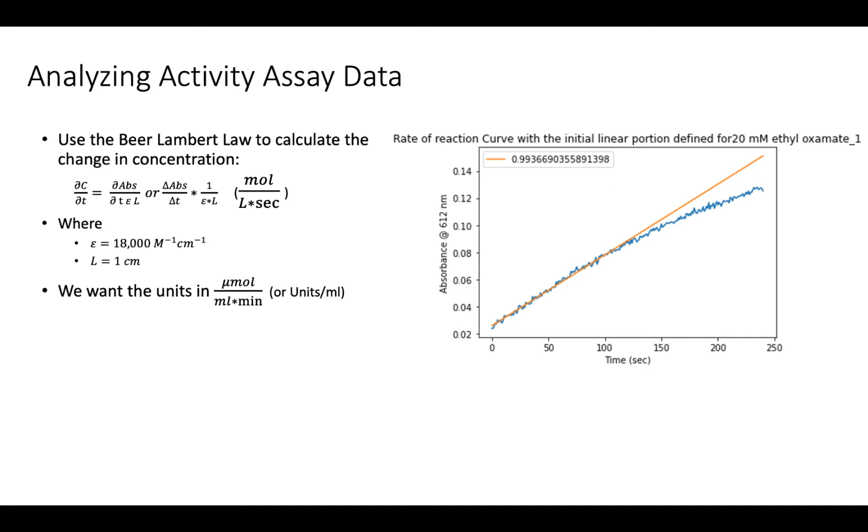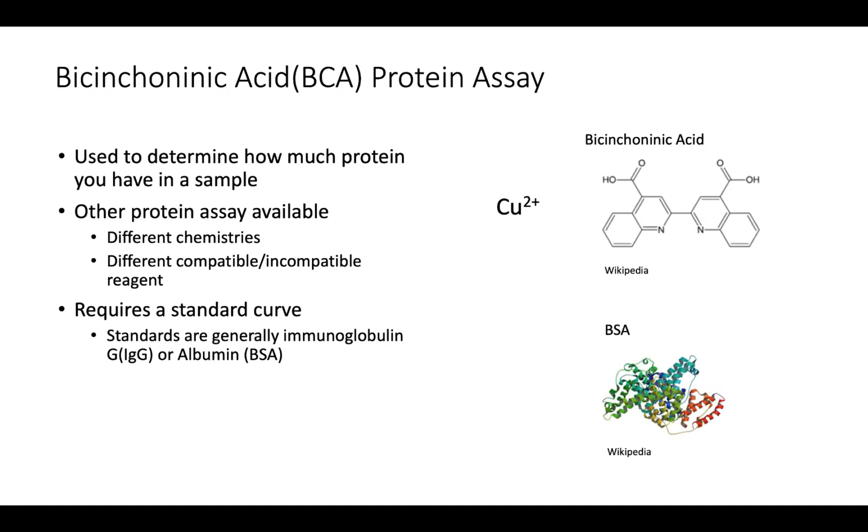The activity assay is what you will be using over and over in both Project 1 and Project 2. Take time in this project to understand the assay and to be able to quickly go through the analysis of it. So take time to learn how to set it up. There are some tips for setting up and organizing your Excel spreadsheets for this activity assay that will help you in the long run as you go through the next set of projects.